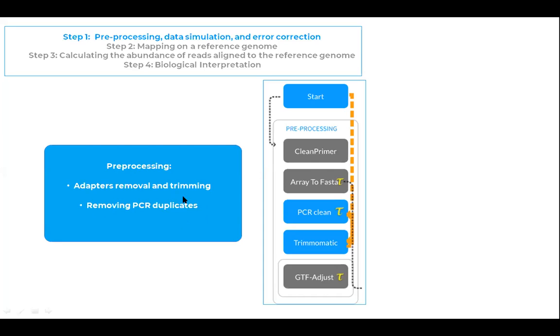The next is Trimmomatic. This Trimmomatic algorithm removes both technical sequences as well as the adapter sequences. So eventually you will only be left with the clean sequencing reads.